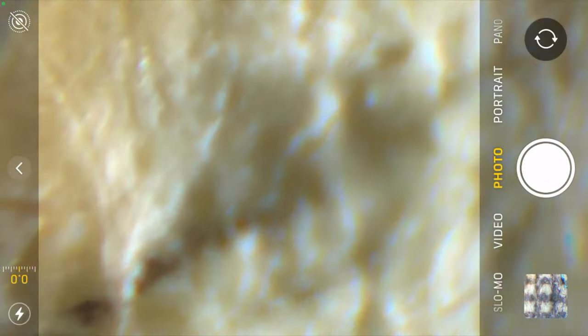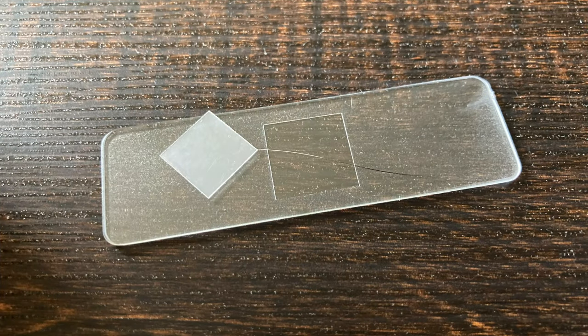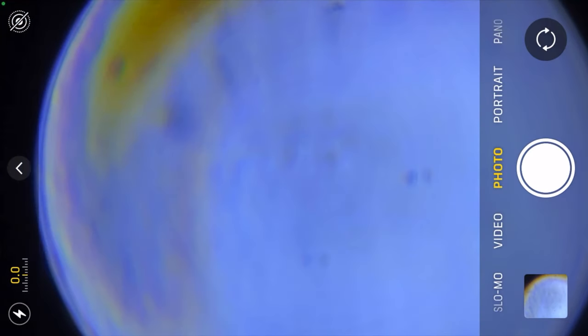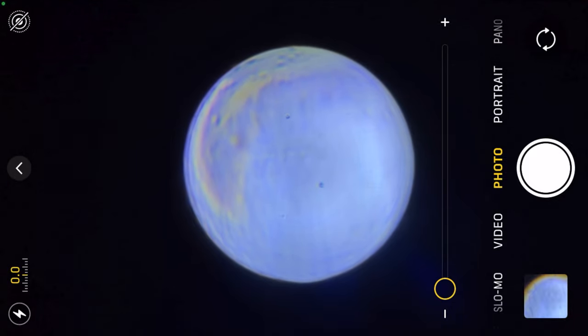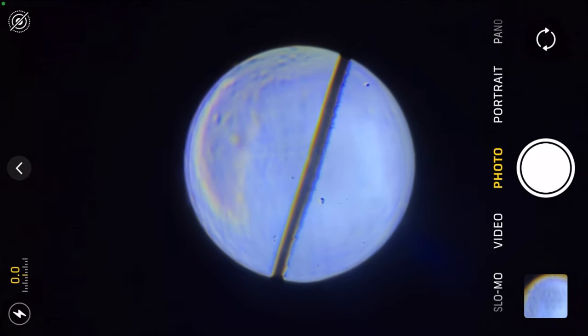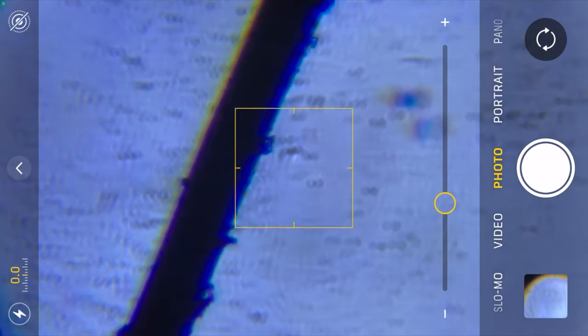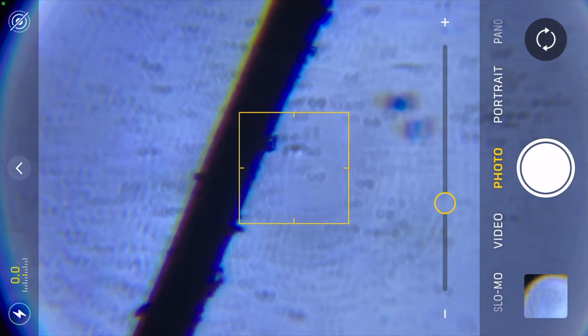Out of all the items featured in this video, I think the dollar bill is where the microscope excelled. I also took a close look at a cat hair. Just how big can this setup enlarge a hair? It's about that big. It is a little interesting — I'm surprised at how the hair is not smooth; the side looks rigid.